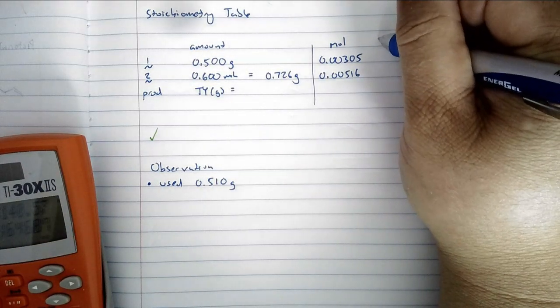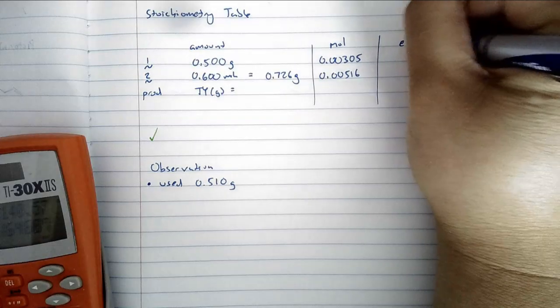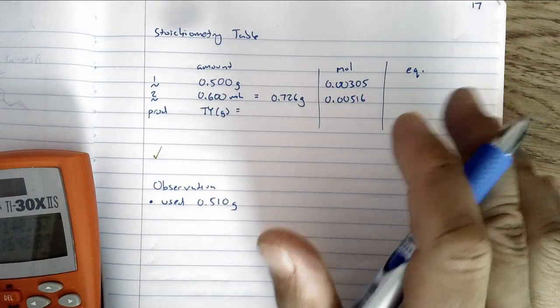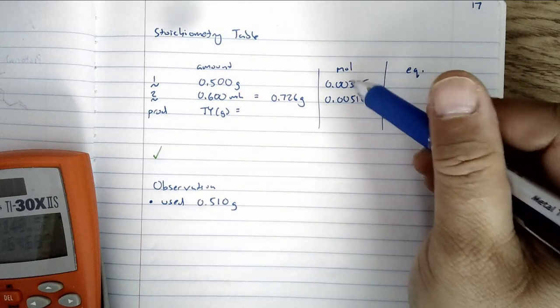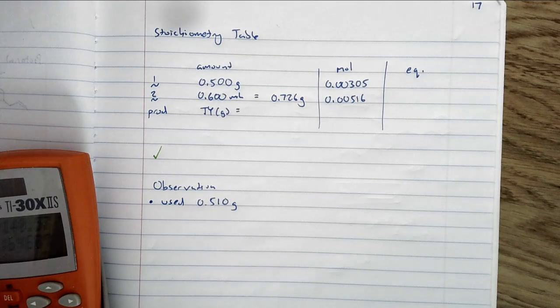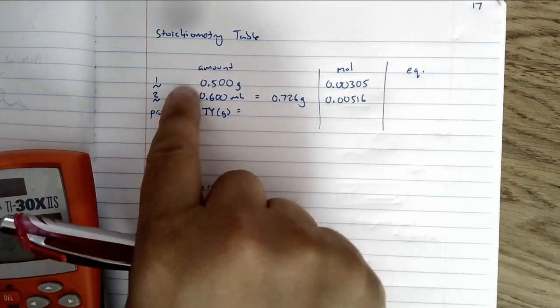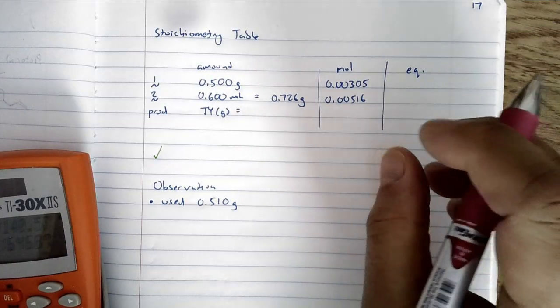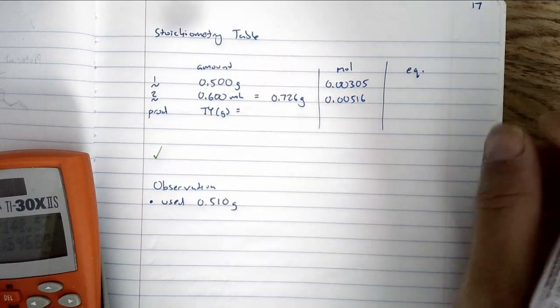The next column is called equivalence, and I'll just put EQ. EQ is the ratio, the molar ratio, but the issue is I want one of these to be the limiting reagent. You're going to set the limiting reagent compound to 1.00 equivalents.